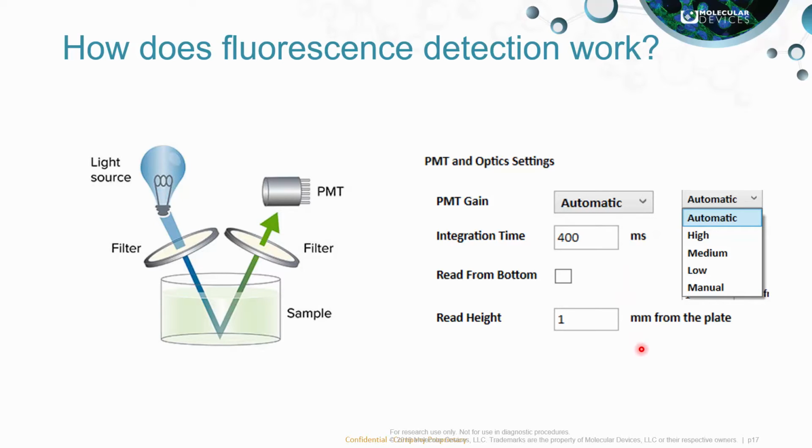You also have the option of reading from the bottom, which is advantageous for coated plates or cell-based assays where the signal is coming from the bottom of the well.